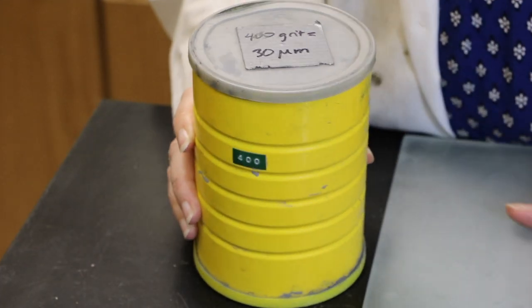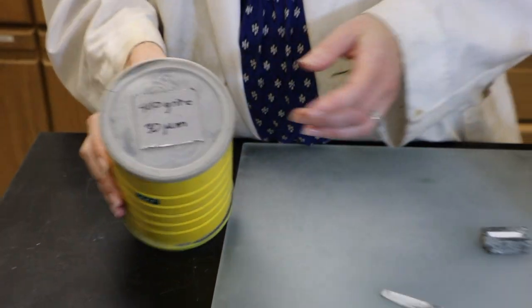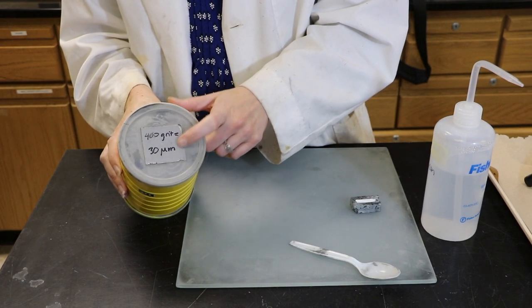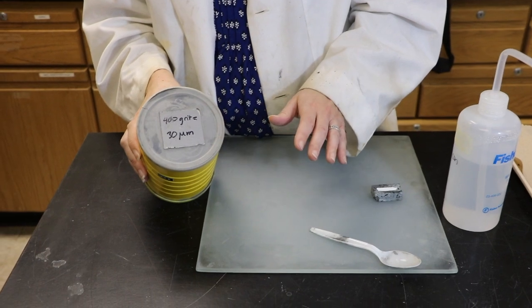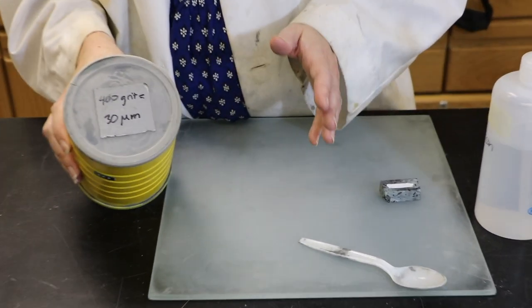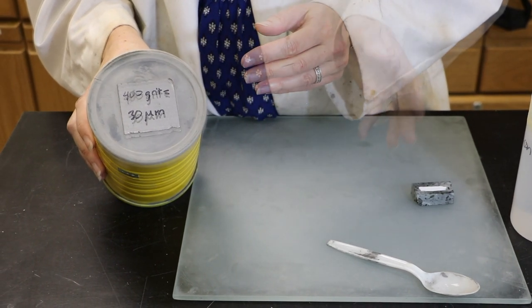The theory behind polishing is that you want to polish using a coarser grit, meaning a higher micrometer number like 30 micrometers first to flatten out your sample, and then you go to smaller and smaller grit sizes. The next size down we have is 15 micrometers and then maybe 9 micrometers after that.